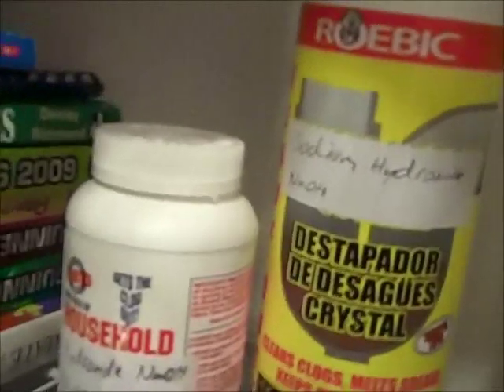If you shake this stuff, it quickly fills with bubbles, making it near useless. However, if you shake the Ace ammonia, which I don't feel like demonstrating, it is completely surfactant free, and hence that shows it's slightly better. Alright, next is sodium hydroxide.